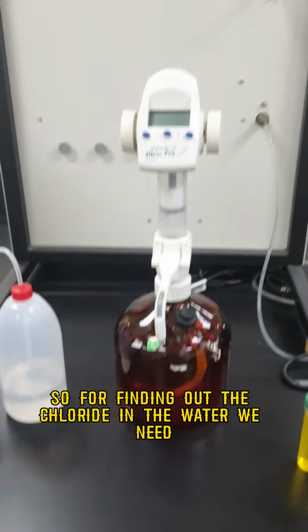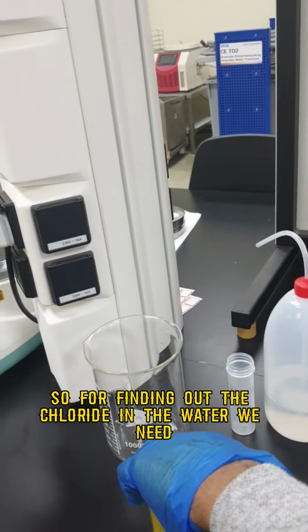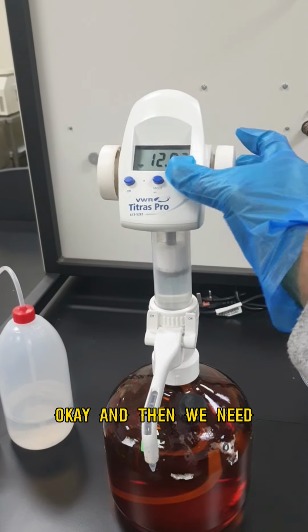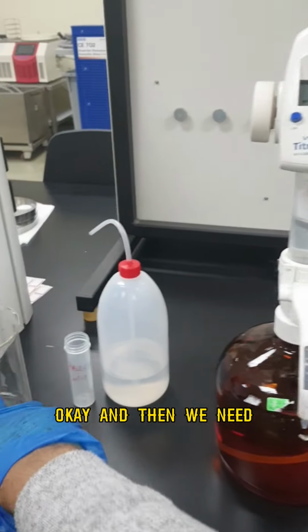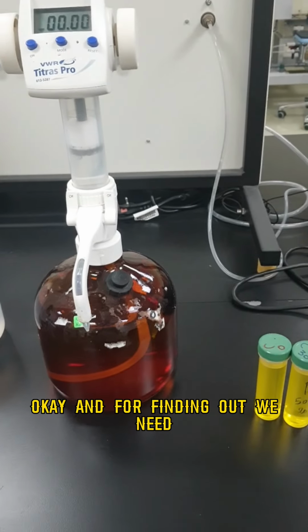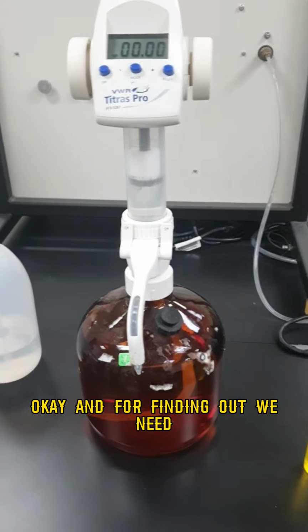So what happens here when we titrate using silver nitrate? It is going to form a precipitation reaction, and at the end we are going to get a reddish brown color, or you can say a brick red color. For finding out the chloride in the water, we need this digital titrator, you can see here, and then this is our indicator, potassium chromate.